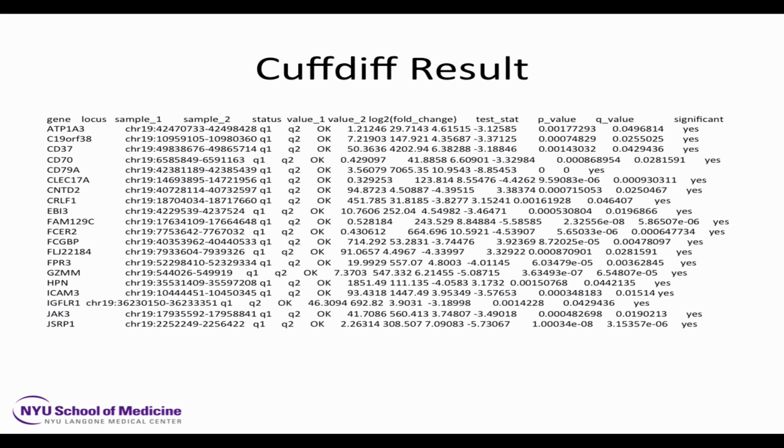If the copies are so identical that for whatever length of read you're doing, let's say 100 bases, there is 0 difference between the 2 copies of the gene, TopHat will guess. It will map the gene to one place or the other, and it will actually give a lower mapping quality score to that gene, meaning it maps in more than one place, but it will still count it as expressed here or there.